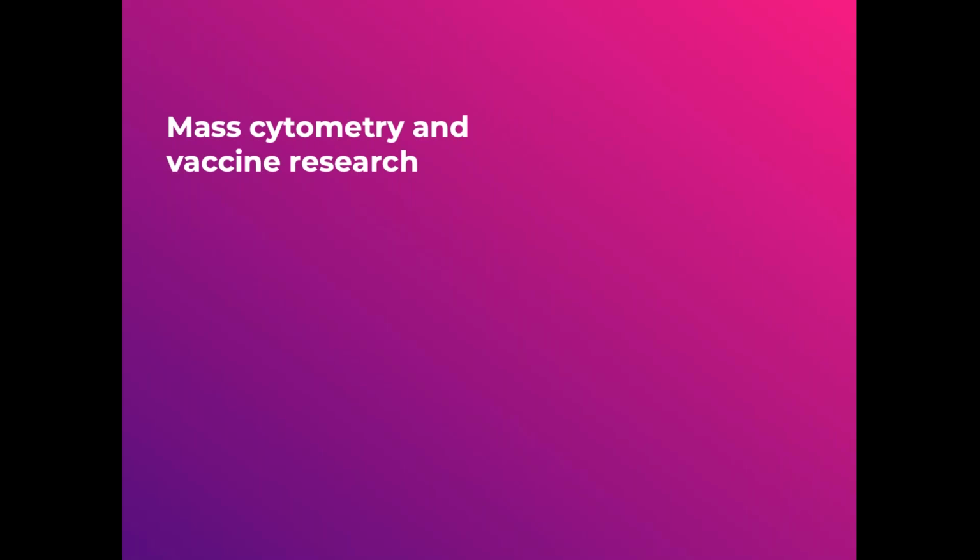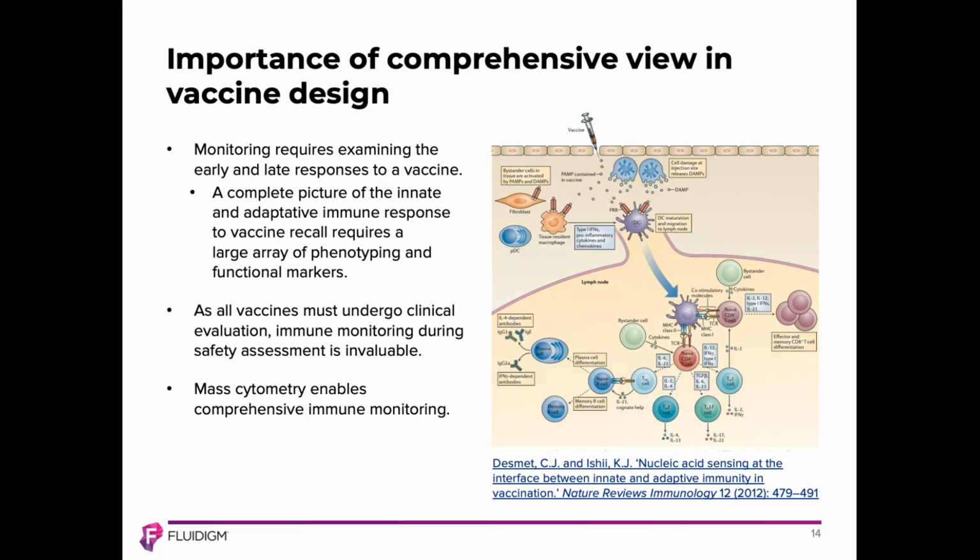So this section break is just introducing us, moving away from specific focus on infectious disease and now focusing on the actual application of mass cytometry to vaccines. So the power of mass cytometry can also be applied to vaccine research.